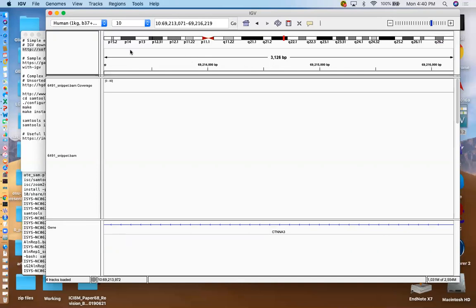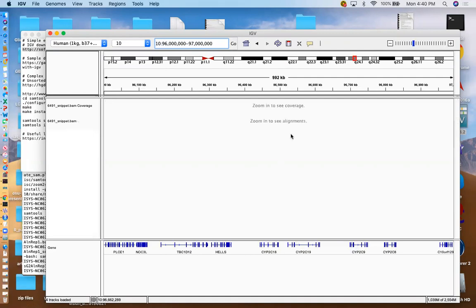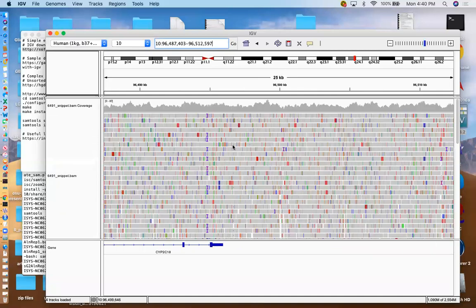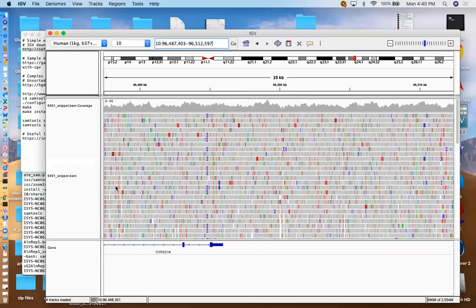Oh, sorry. We were in the wrong segment. So let's change that. And you can see here are all of the aligned reads from our test sample.